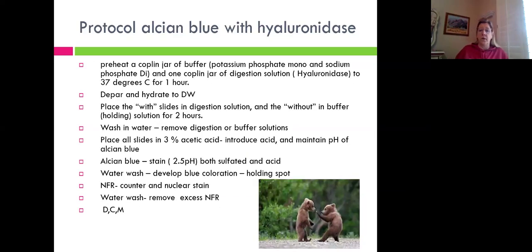All right, so our protocol: you're going to have a warm Coplin jar of buffer. And I say warm, not hot. Some people will just use their buffer at room temperature, and that's fine as well. Now, this buffer is a potassium phosphate monobasic and a sodium phosphate dibasic.